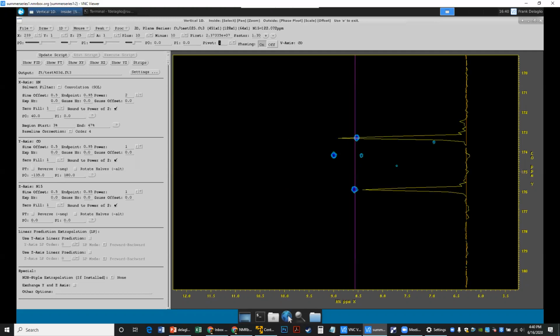Now, this is the quadrature mode. In the real dimension, the quadrature mode is because there are two detectors. In multidimensional NMR, we generate the real and imaginary parts with the States-TPPI kind of manipulation, right? When you said 256, do you mean 256 complex points or 256 of either real or imaginary points? I mean 256 of either real or imaginary points. Okay.